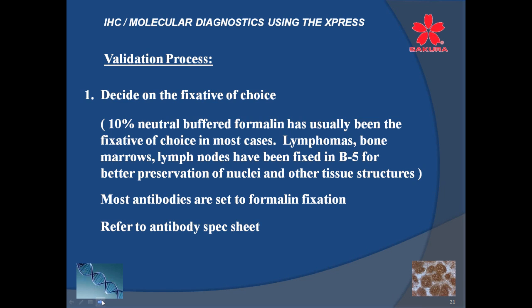But for the most part, formalin is a universal fixative and is what we use here for most everything except bone marrows. We use B+ for that, so we don't have to fool with B5 and the mercury hazards and so forth. But the formalin, I still like that. I still think that we're used to that morphology, so why not continue to use it and just work it into the Xpress, which I'll go into momentarily as to how we do it, how you too can do it.